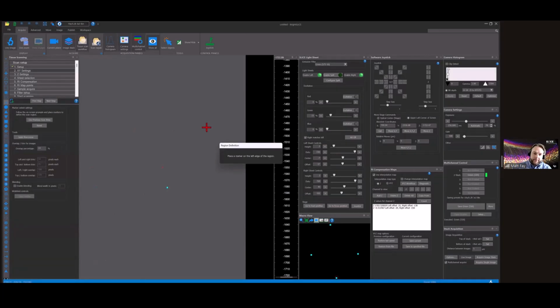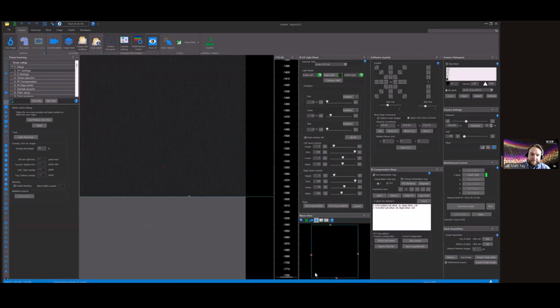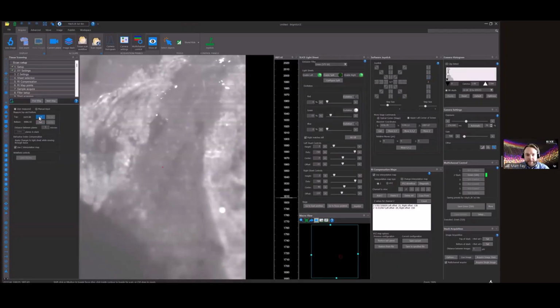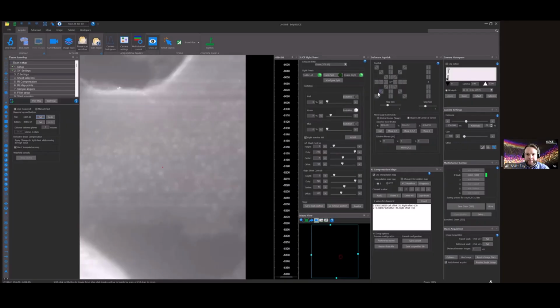We'll choose to set up our XY area by placing markers. We can use the Go-To feature of the macro view to quickly and easily return to the markers we placed at the XY extents of our sample earlier. Once we place these markers, you'll notice that our XY scan area will display in the macro view. Moving on to the next step, we need to set the depth extents of our volume. By navigating with the stage's Z-axis, we can move to the top and the bottom of the sample and press Set for each in the workflow.